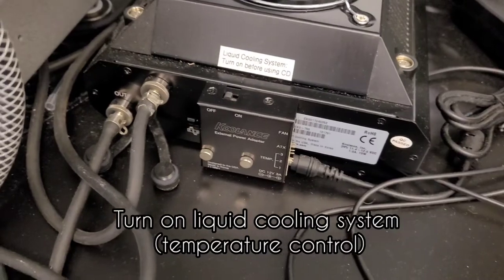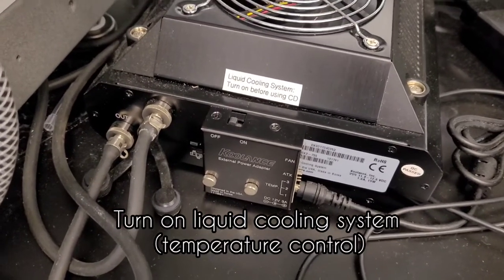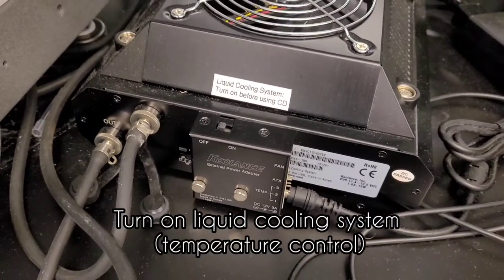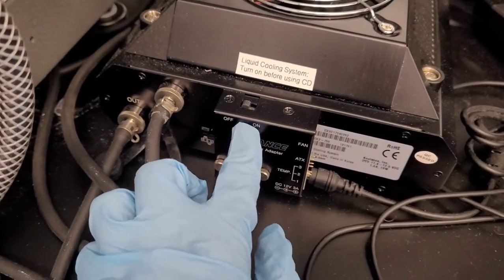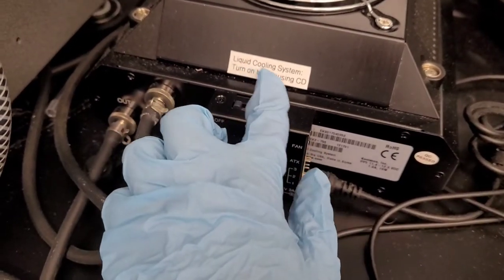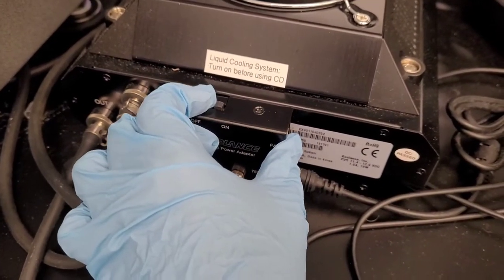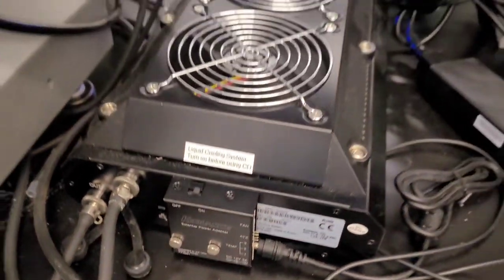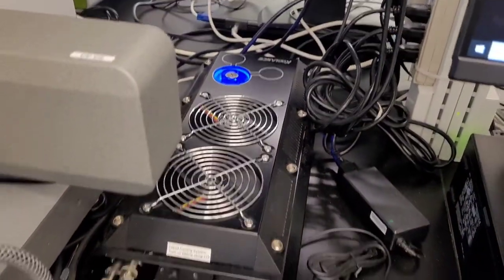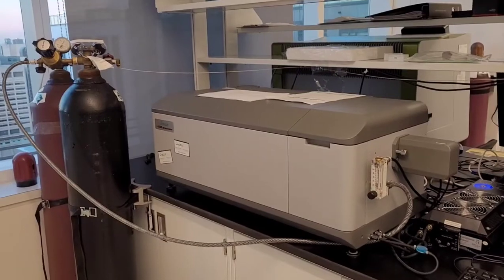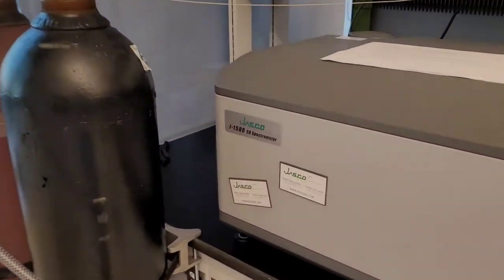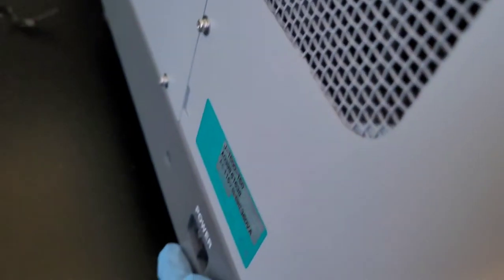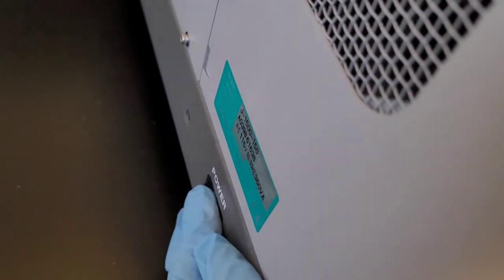Then since we are doing thermal denaturation and temperature is important, we are going to turn on the liquid cooling system. Then after a few minutes have passed, you can turn on the machine by using this switch here.